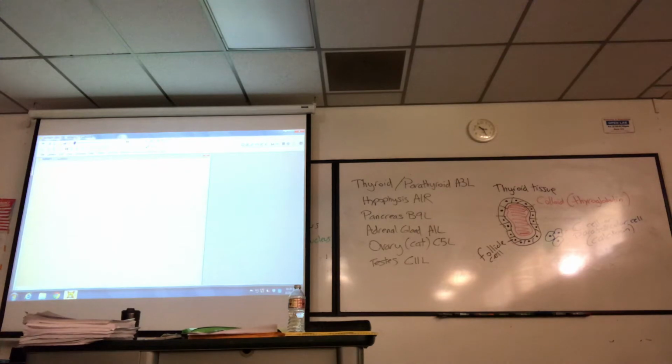Let me go in order here. Let me do the thyroid parathyroid slide first. The proper way to use the microscope, start with low mag.